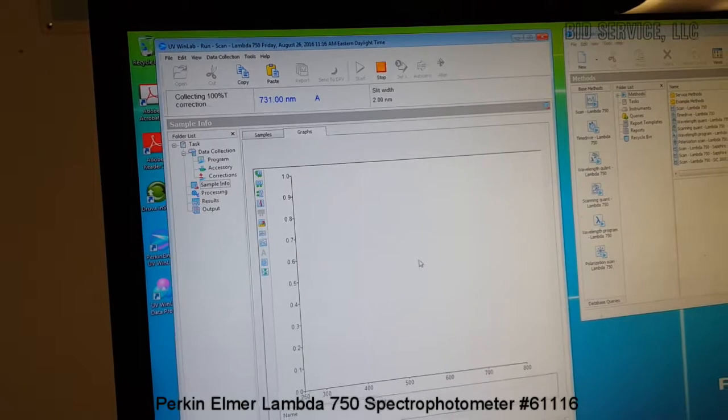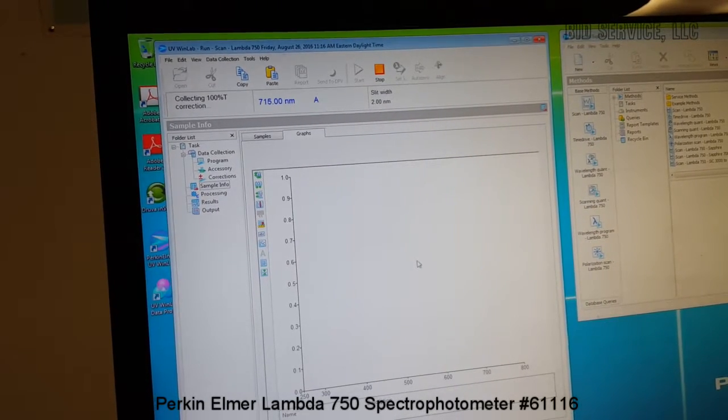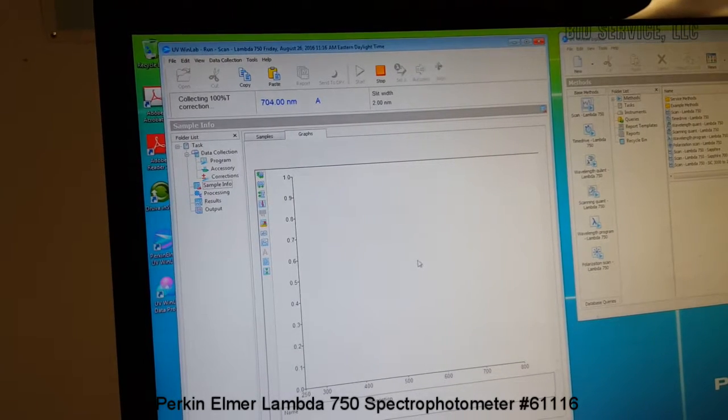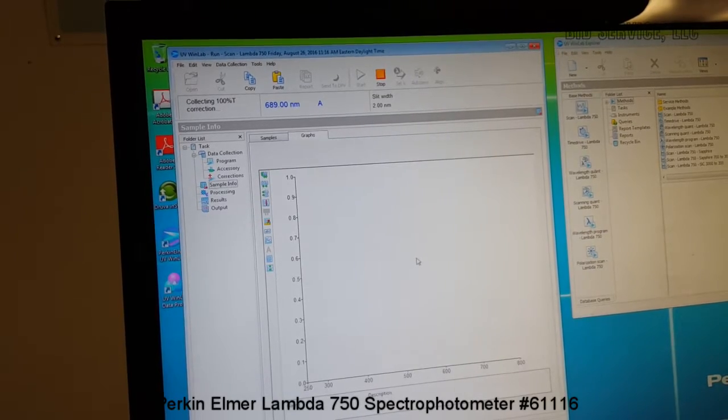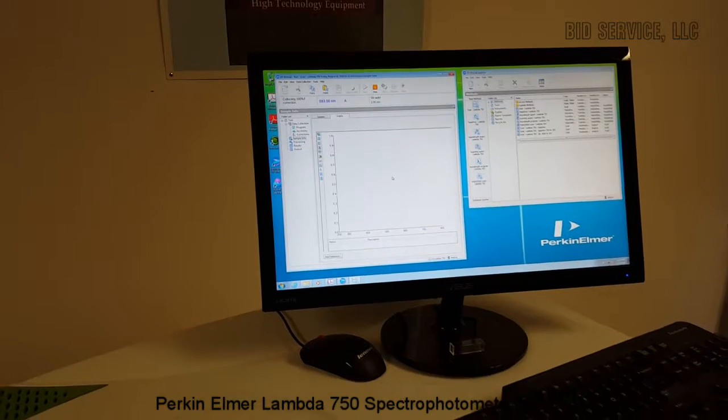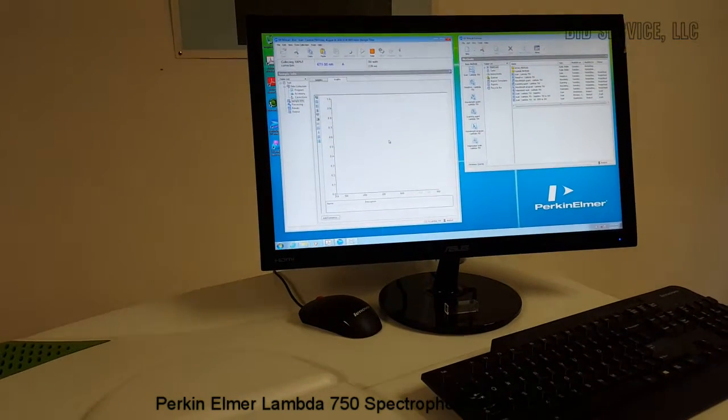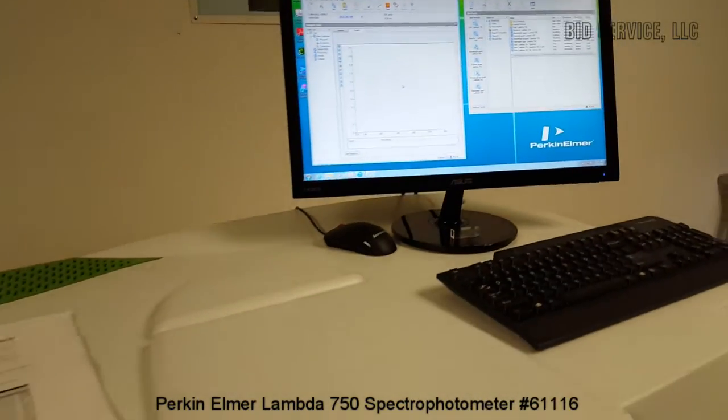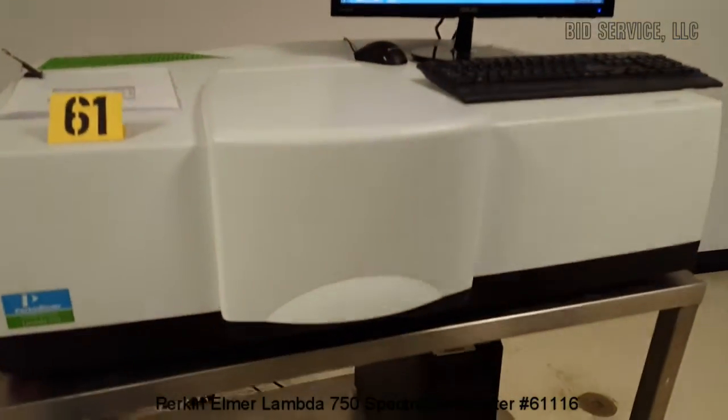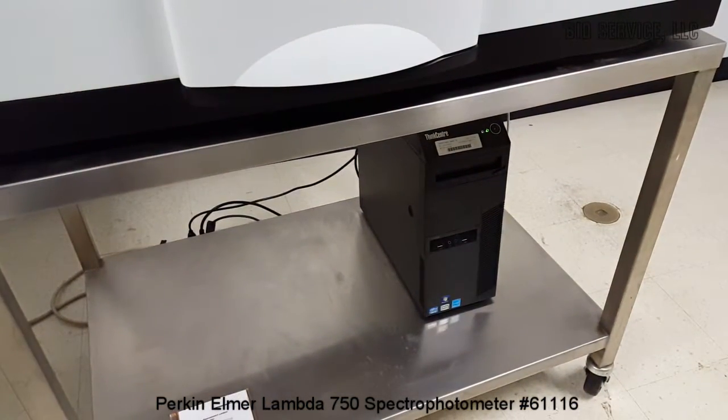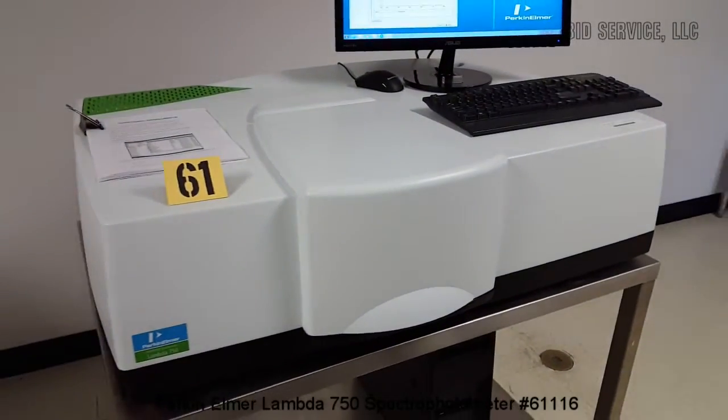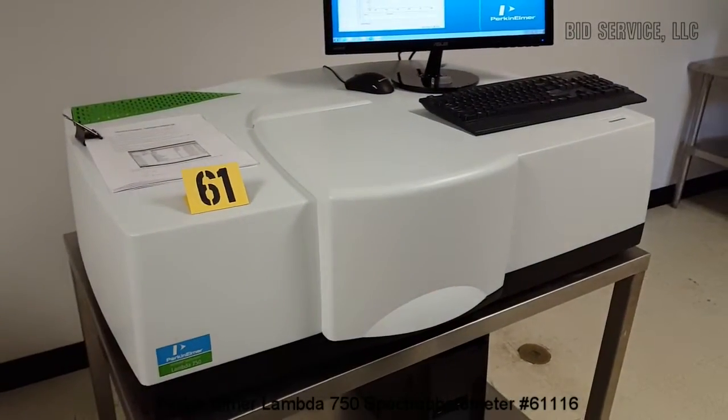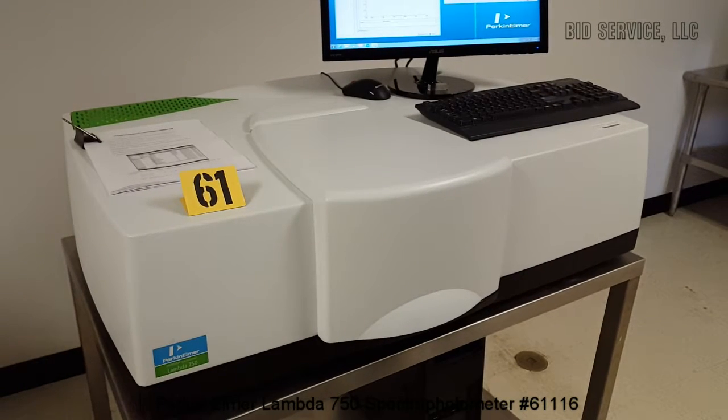So this cuvette is used for liquid samples. The detailed user's manual for the WinLab application will be included on a DVD. And all the system cables necessary to interface the unit to the personal computer will be included.